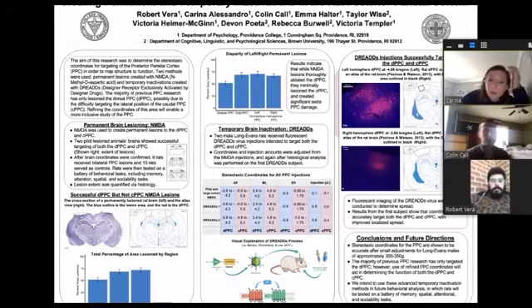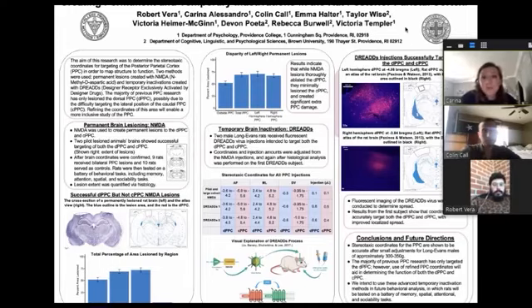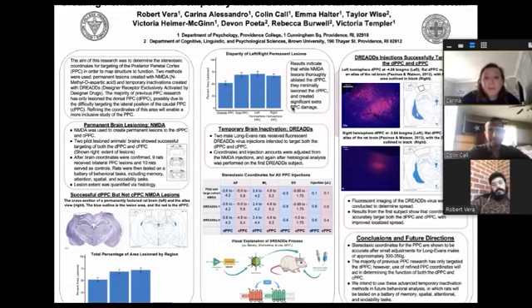Yeah, so going forward, our intention was to use these coordinates in our research with the new DREADS pilot rats, and to test them on a battery of attentional set shifting tasks and things like that, in order to match the structure of the PPC to functions that we have found. And in the works, it was put on hold this semester, but going off of what Colin was just saying, we're trying to figure out if CNO is the right activator for the brain region that we're using.